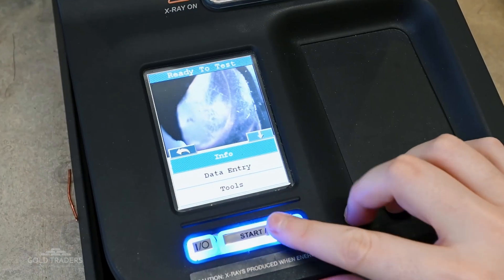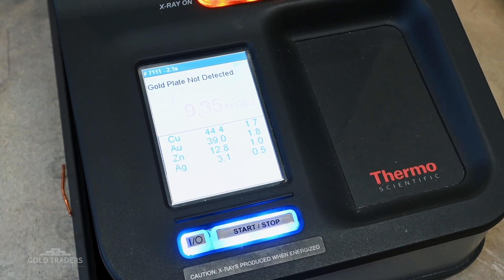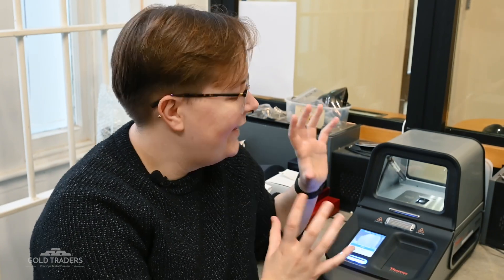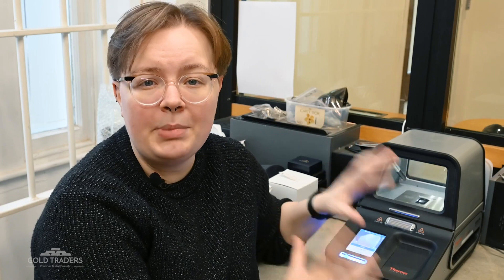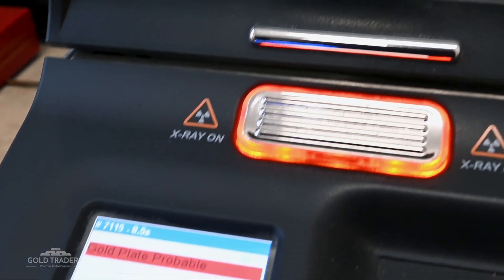This incredible machine can analyze a piece of metal in roughly five seconds and give us all the information that we need to know about its composition. It can tell us purity by analyzing the metal alloy, and this particular model also has the special ability to suggest if an item might be plated by the information that it gathers.